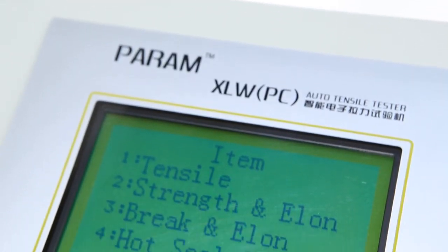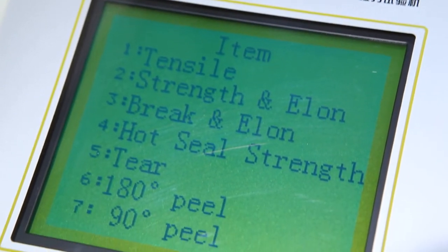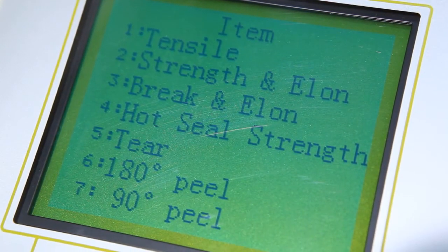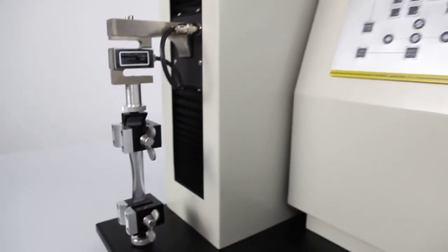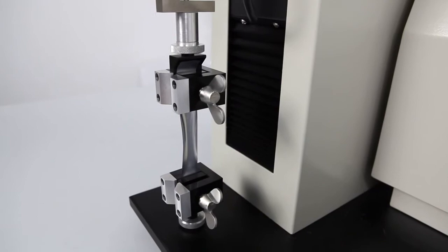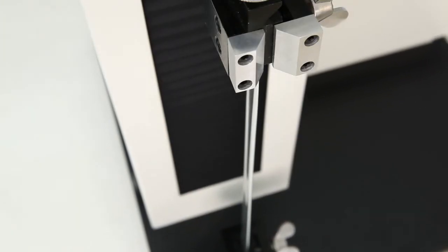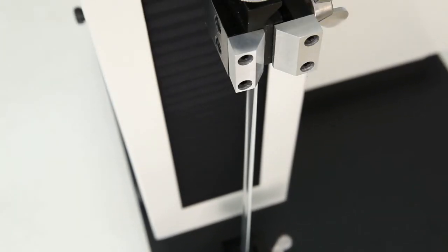It can be used to measure tensile strength, healing force, tearing force, heat seal strength and various other properties of packaging materials, and provides research institutions and manufacturers with an excellent solution for analyzing the relevant physical attributes of materials.